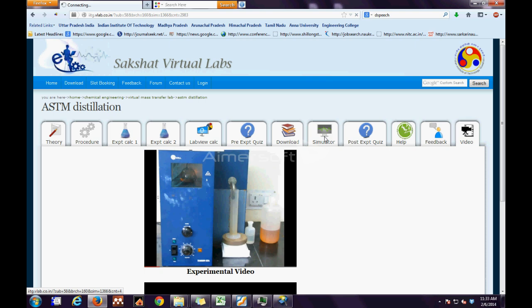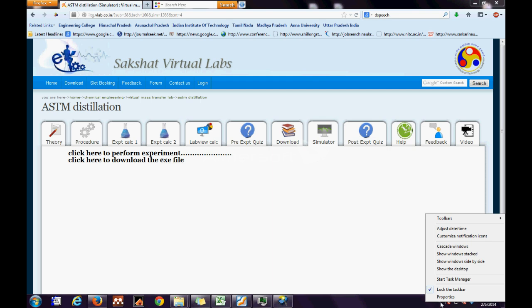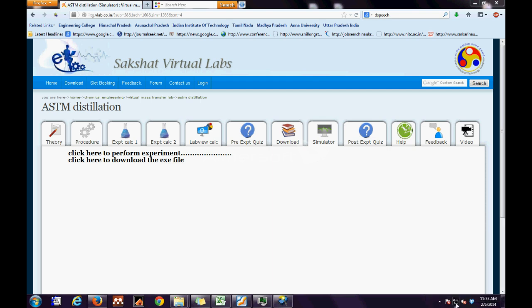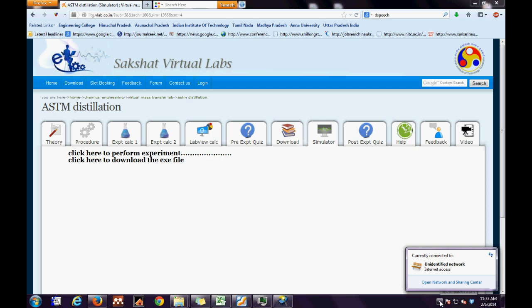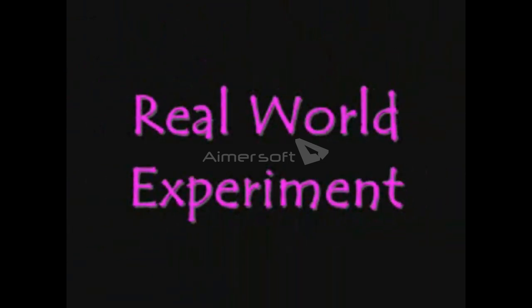The user has to move backward to the simulator, click the link for the .exe file, download the .exe file, and run it to view the virtual experiment. Prior to the virtual experiment, the user has to look into the real world experiment. So here comes the real world experiment.